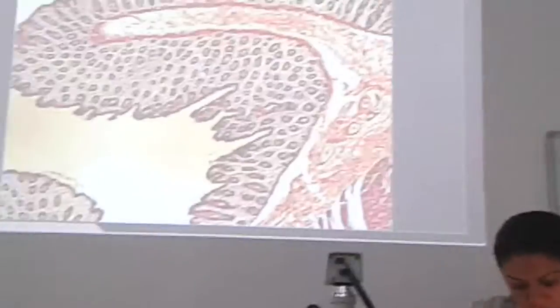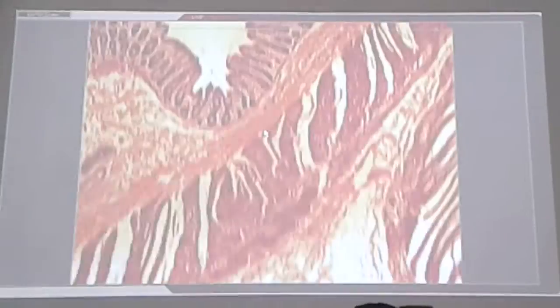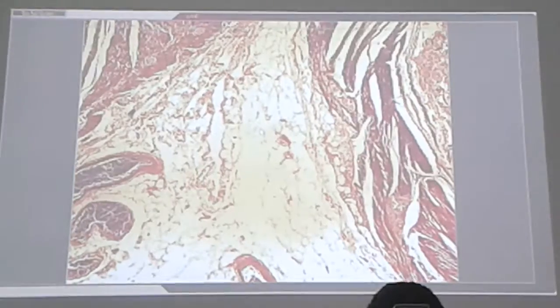I'm in the large intestine. Okay. Someone tell me the layers of large intestine.